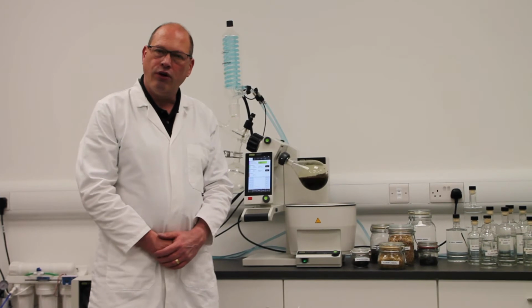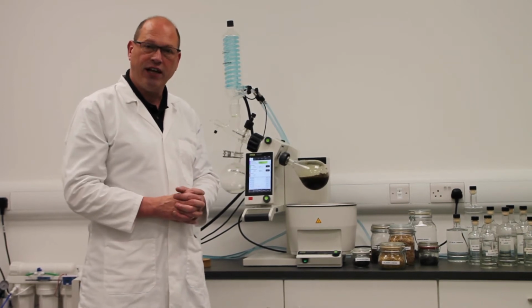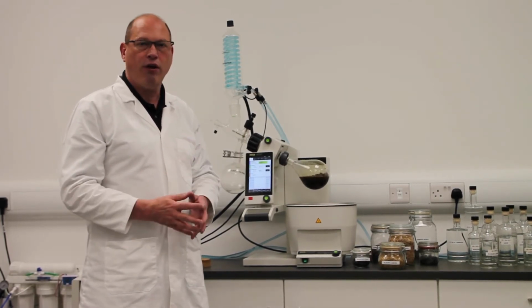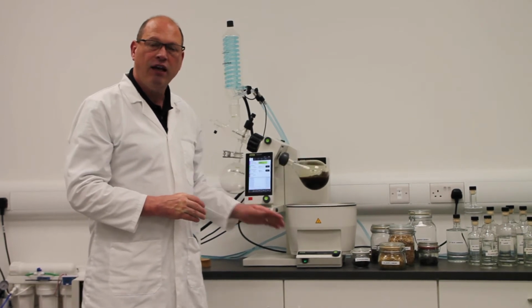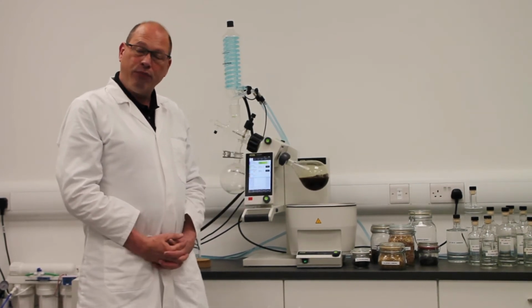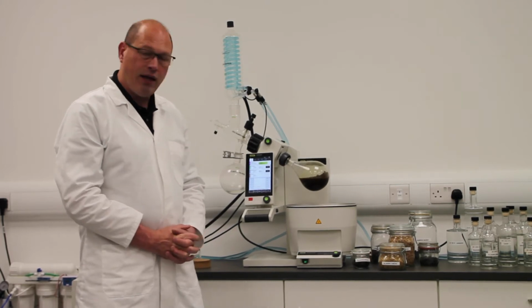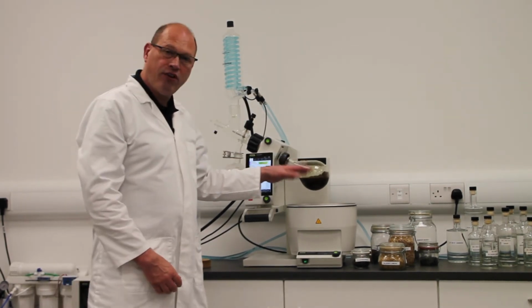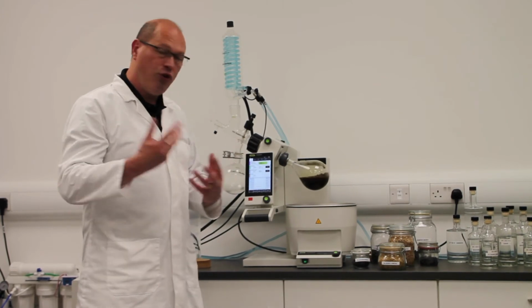The other advantage to this is that you can completely control the temperature of the distillation by setting the vacuum in the flask for whatever setting you want. If you want to do it at atmospheric pressure and therefore normal distillation temperatures, you can. If you want to distill at low temperatures, then again it's just by modifying that pressure that you modify the temperature in the flask. And as we've spoken about before, that's key to any extraction. The other advantage of this is that you can set this to reflux, so you could actually reflux this juniper for a period of time if you wanted to carry out some transformation using the heat, for example.